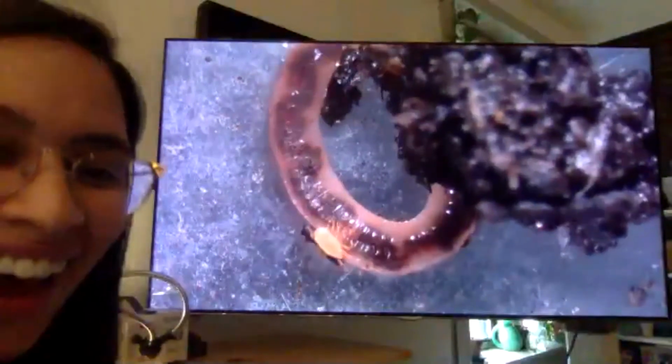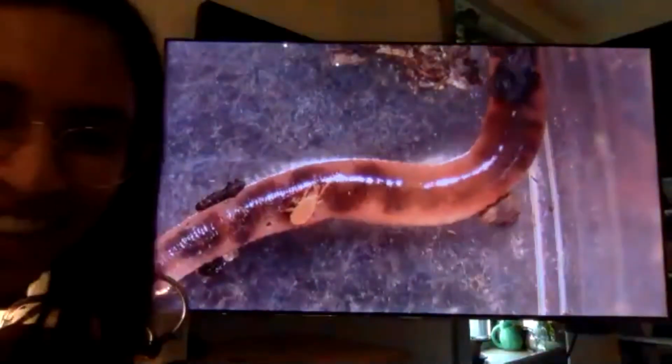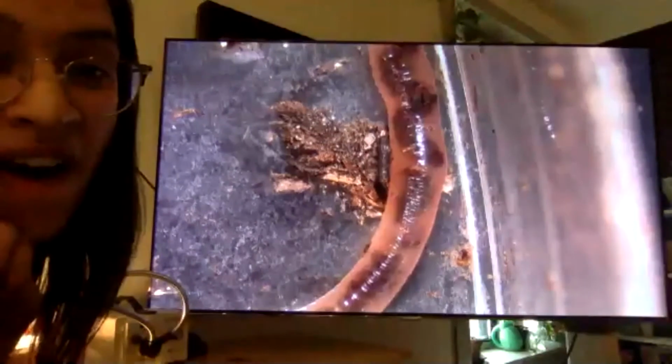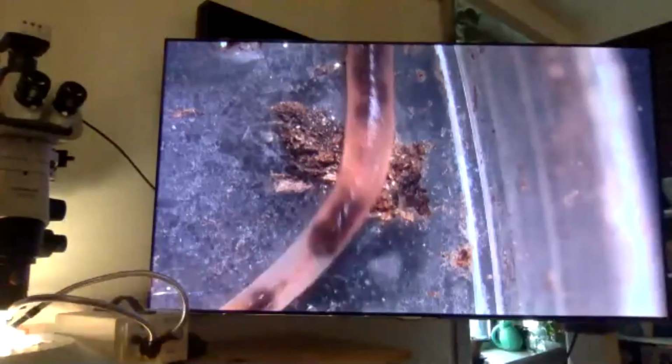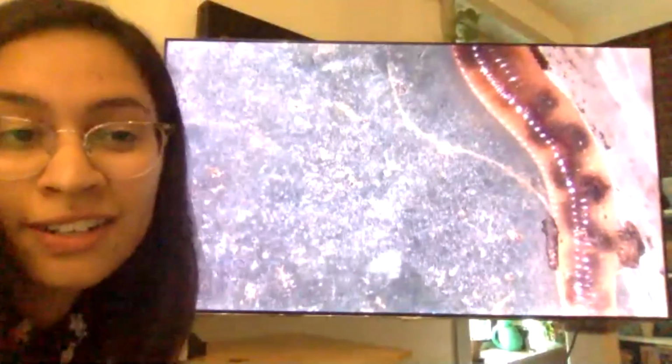So I was just looking at this worm, and well, he has a little friend that he's carrying around with him, so that's cool. Dalmatian worm. Yeah, do you see the spots inside? Wait, are those just spots, or what is that inside? What do you think? Oh, food? I'm guessing the half on the front is food, and the other half is something else. Why would it only be on one half? Because it got digested, I mean poop.